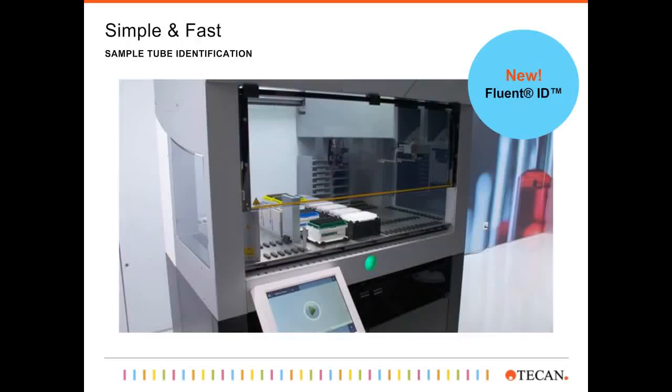a quick loading interface. So the operator will start at the touchscreen. She will load the tubes onto the work table, and we're going to get 96 tubes in 3 grids. And when she's done loading, she presses continue, and we're ready for the assay to go. So let's go ahead and start that video.